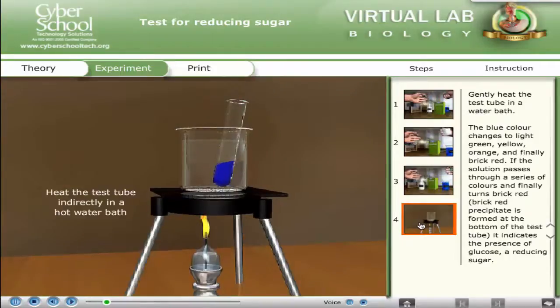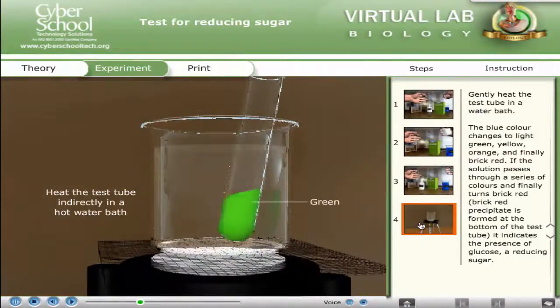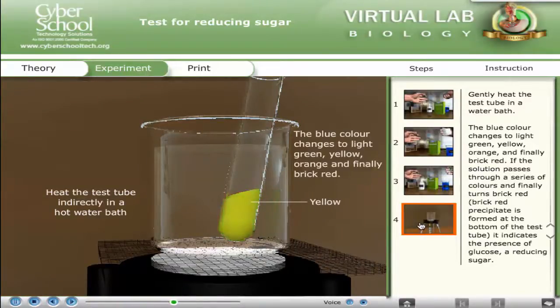Gently heat the test tube in a water bath. The blue color changes to light green, yellow, orange, and finally brick red. If the solution passes through a series of colors and finally turns brick red, a brick red precipitate is formed at the bottom of the test tube. It indicates the presence of glucose, a reducing sugar.